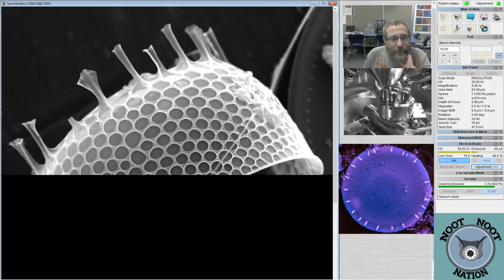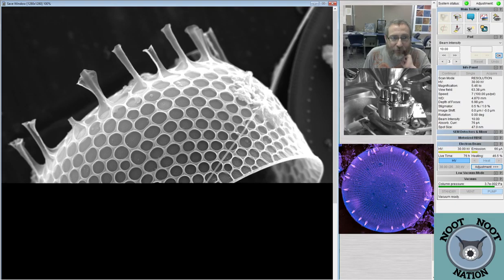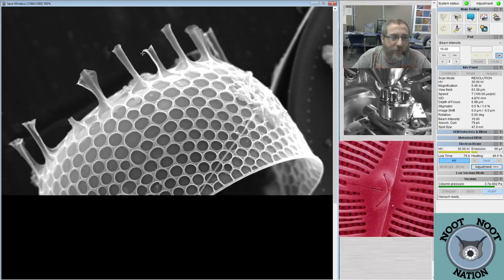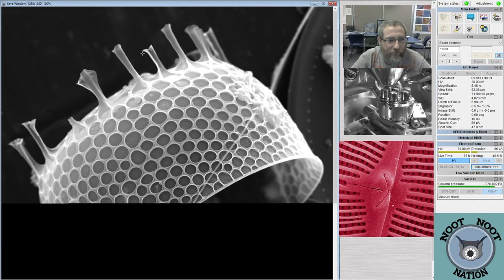It could also be a broken spine, I don't know. But you're right, they do look kind of hollow. I think they actually have a C shape. They're like a pillar with a C shape, like a curled, like half of an I-beam kind of. Yeah, sort of. Nice.